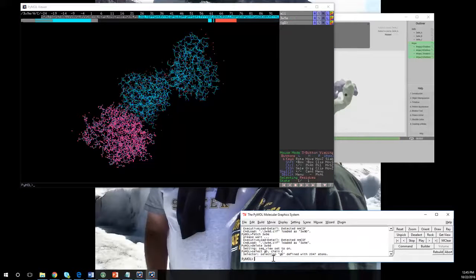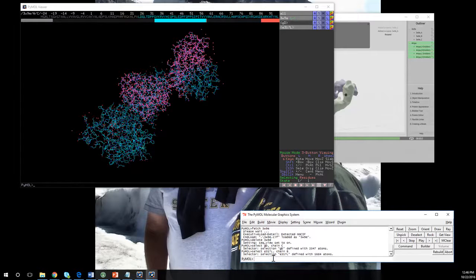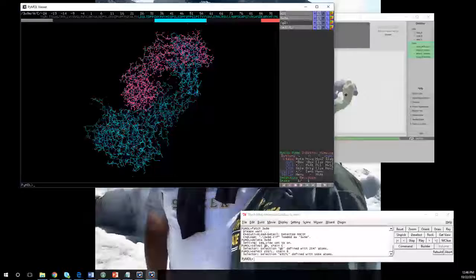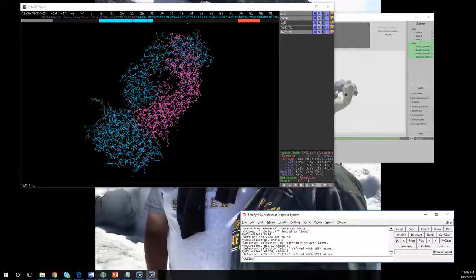If I go to select E317 light chain, comma, as chain B, now I can see I have GD down here, I have the light chain at E317 right there, it's labeled up there. Select E317 heavy as chain A. Okay, so now that's labeled up there.